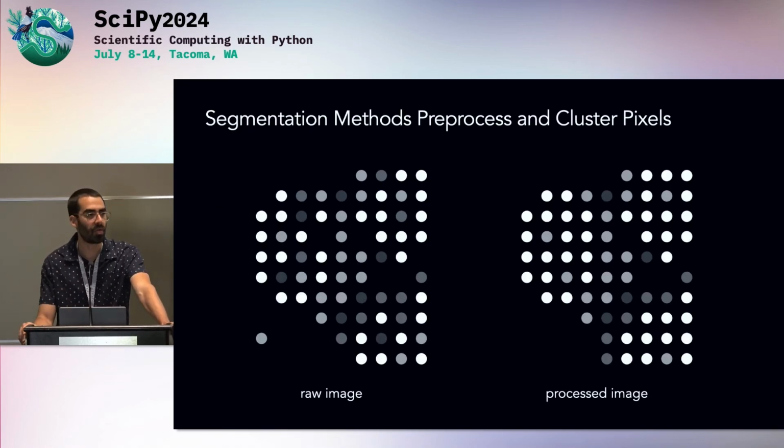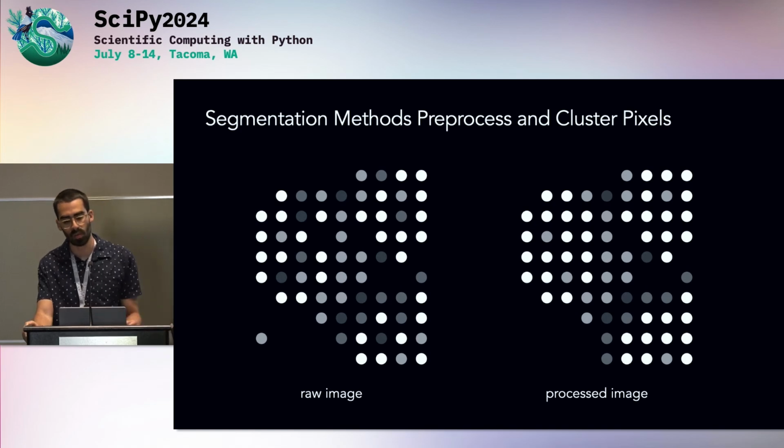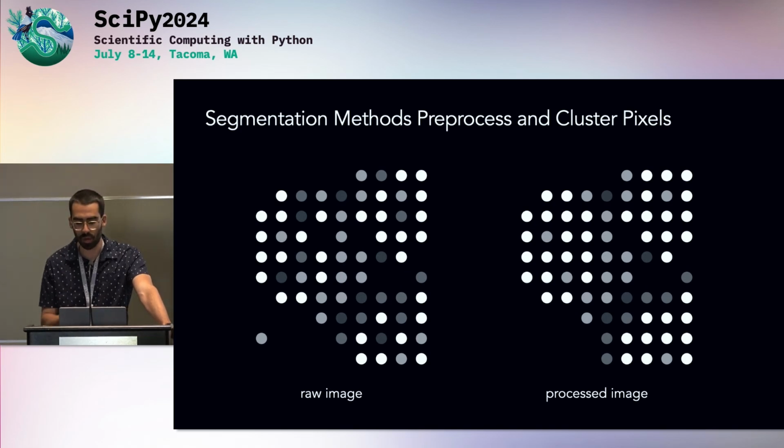So, just a brief review of how segmentation works. We have, for example, this grayscale image on the left, the raw image. We do some kind of filtering just to smooth the image. Then segmentation could be seen as a cut, splitting the pixels apart. Here we have 3 cells, and the cut was where we have the weakest, the lowest brightness between the pixels.